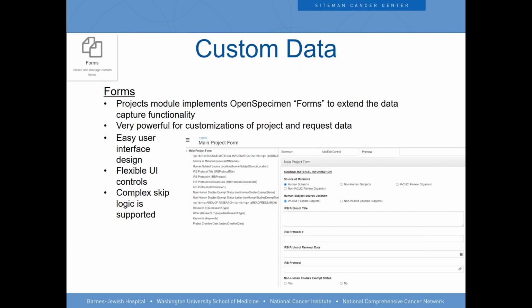And I know this is difficult to see, but I just have some examples here of accessioning, processing, and a pathology review or something like that. And it's just showing a status that can be modified as the laboratory actually performs those services.